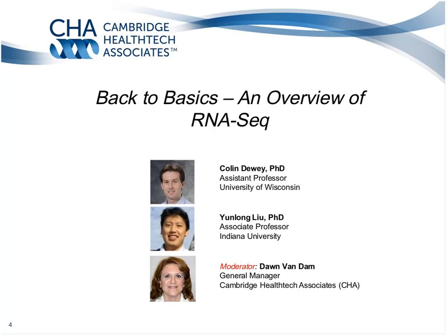And also, when we do the RNA sequencing alignment, if the DNA sequencing for the specific individual is not available, meaning that the variant is not specific to this particular individual, some people will just go ahead and mask all the variants in the 1,000 Genomes Project or in dbSNP.